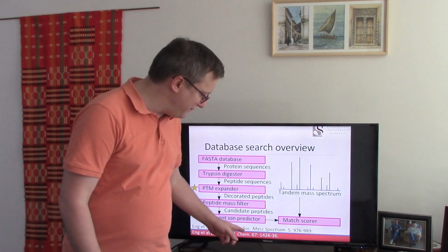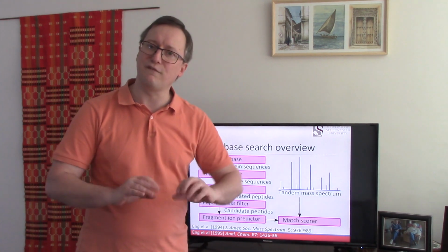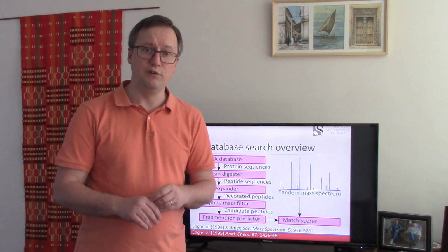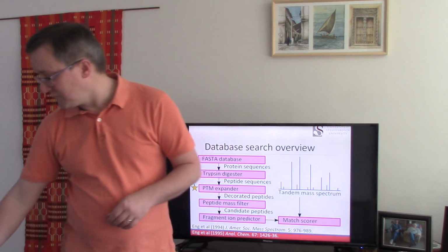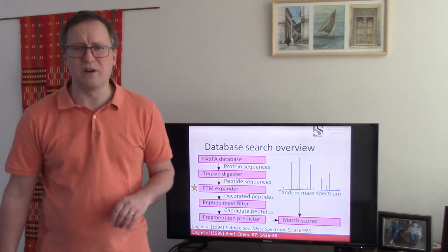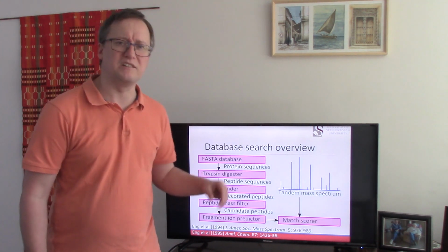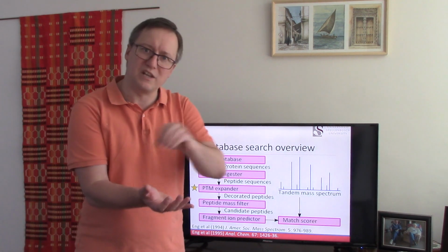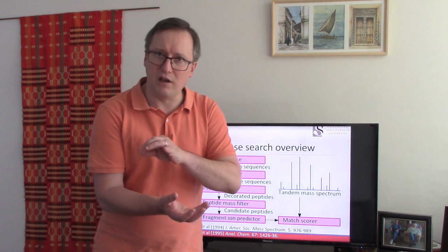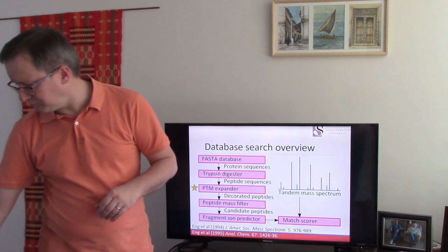The difference between these two papers was the ability to recognize post-translational modifications from our data. So the 1994 SEQUEST was fine for identifying peptide sequences, but the 1995 SEQUEST was necessary if you were going to go looking for things like methylations or oxidations or whatever. So this PTM expander really bears a little bit of consideration, the process of starting with a set of peptide sequences to compare and changing to a set of decorated peptides, ones that have post-translational modifications assigned to particular positions.